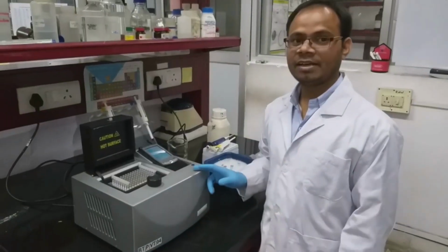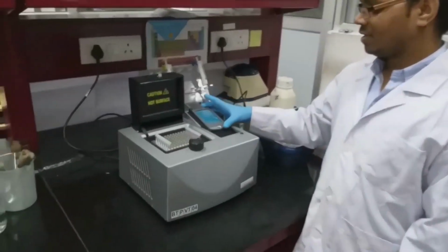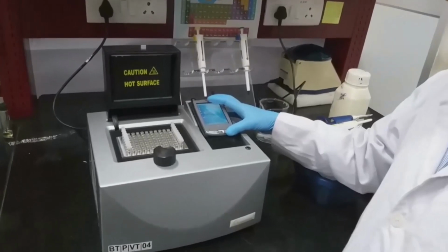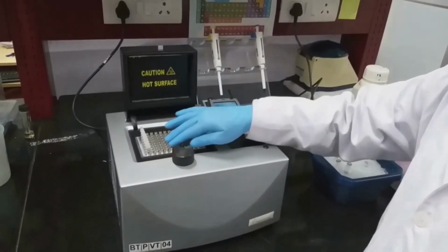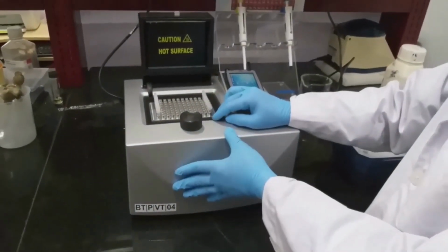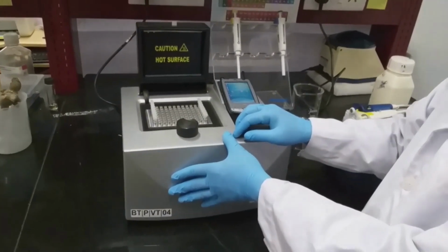This is an earlier version of the thermal cycler, which contains a display unit where we can observe the parameters and change the parameters. This is a hard shield. This is the sample holder, and inside there is a Peltier system which can maintain the temperature fluctuations.